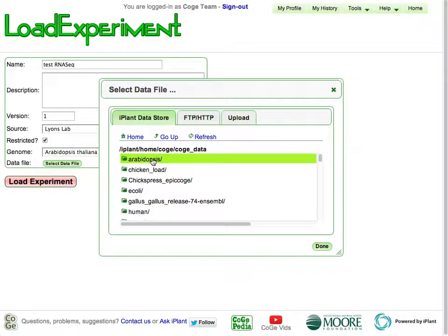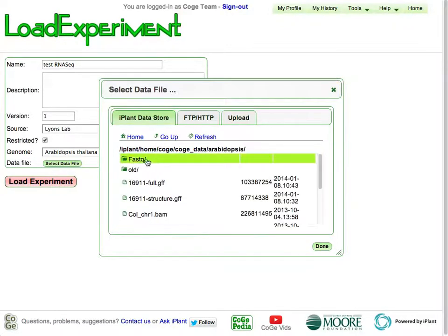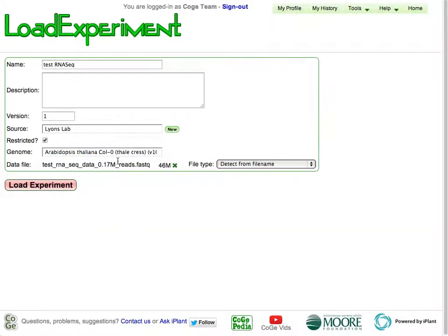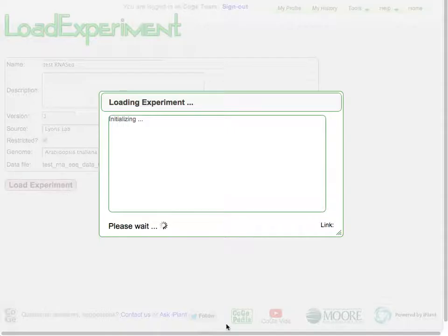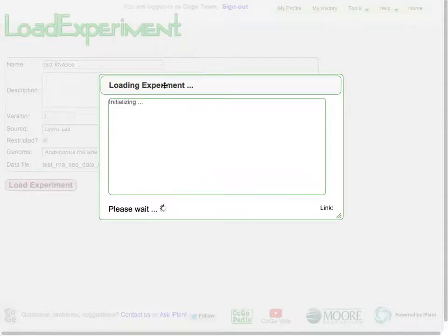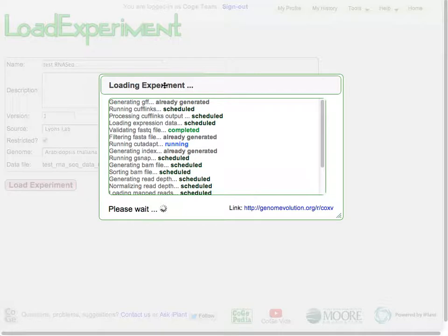Inside of here we've got our Arabidopsis folder. I've got some fastq data, and I'm going to pick this file right here. This is 170,000 reads, approximately 46 megs of data. It's a small set of data, but this is just to illustrate how this process works. So you specify it and say go.